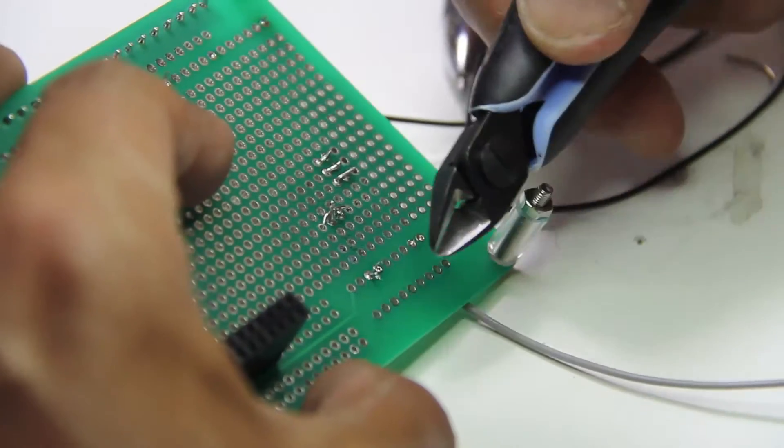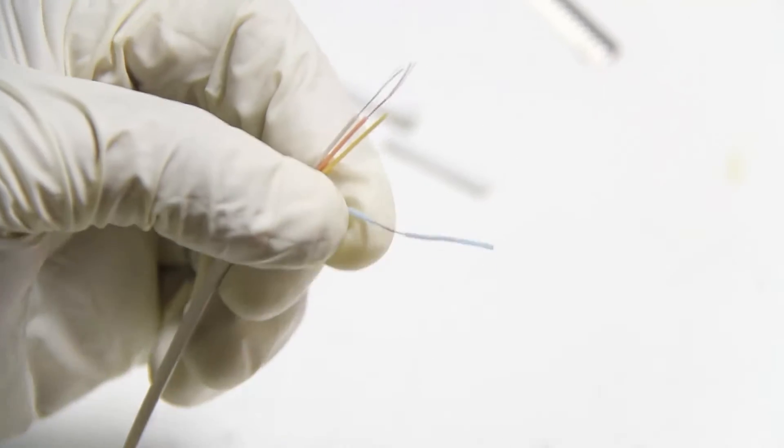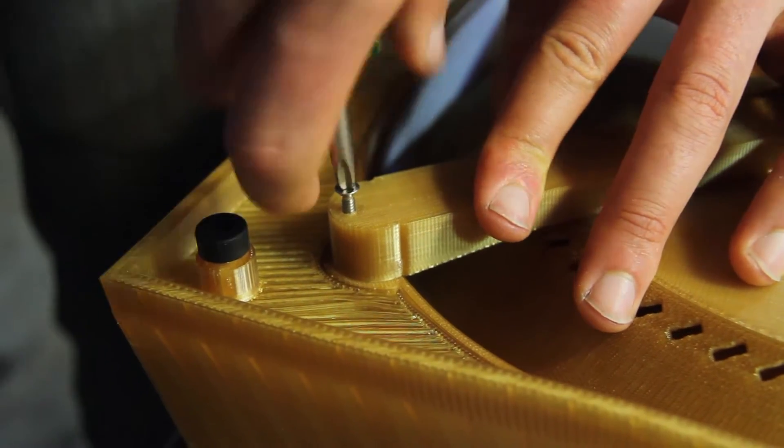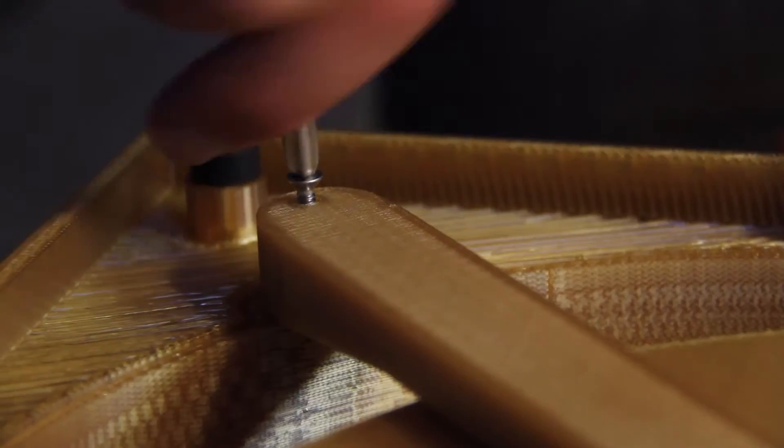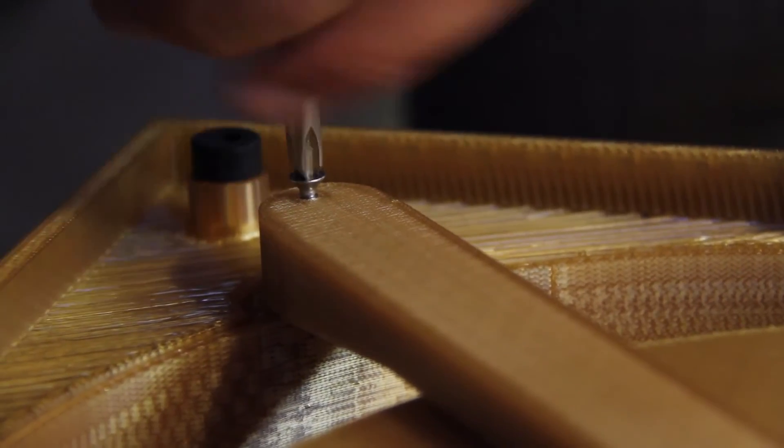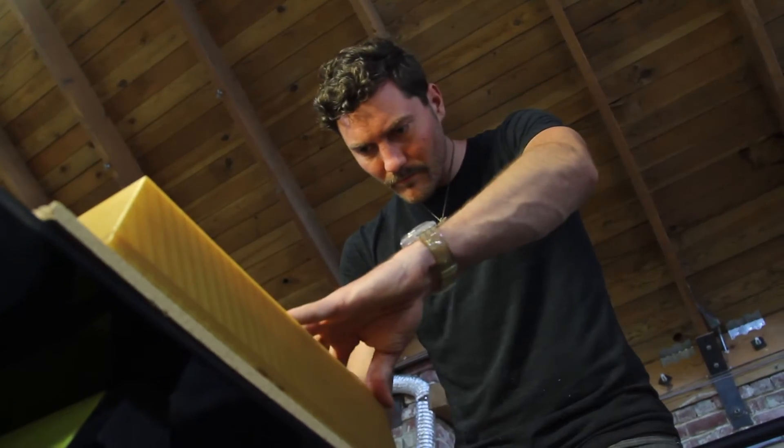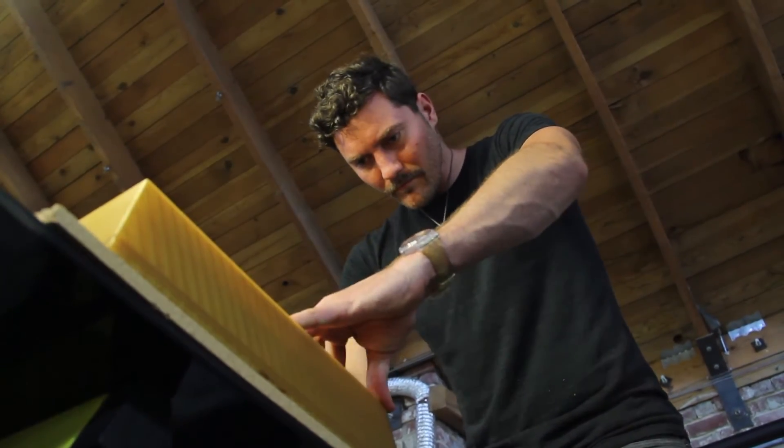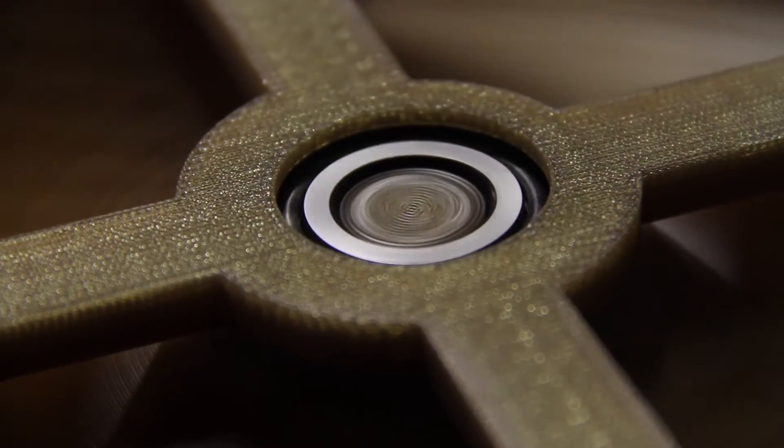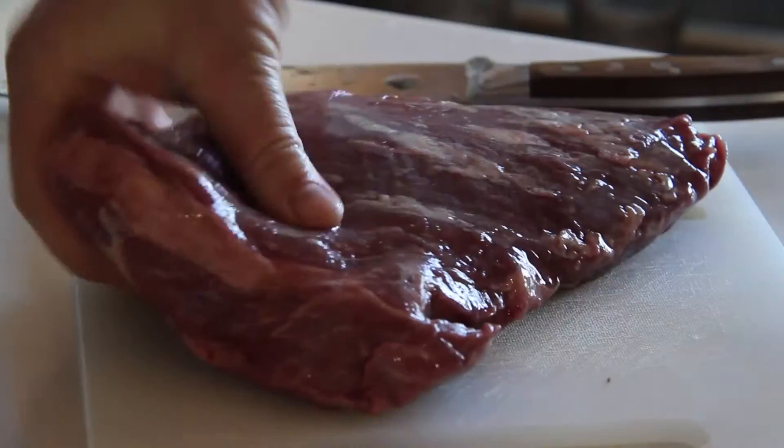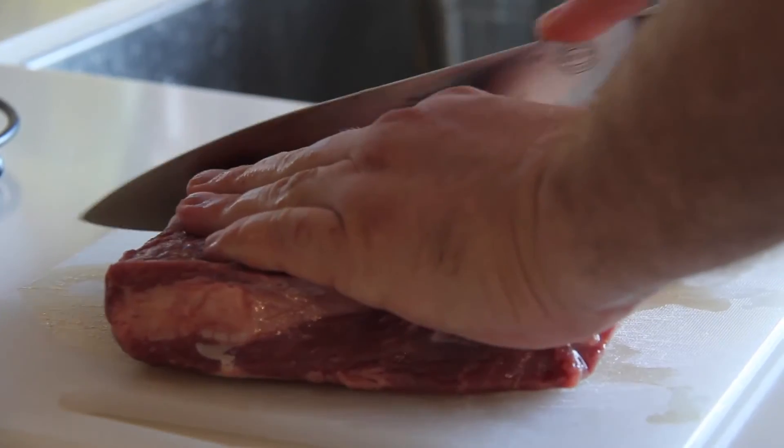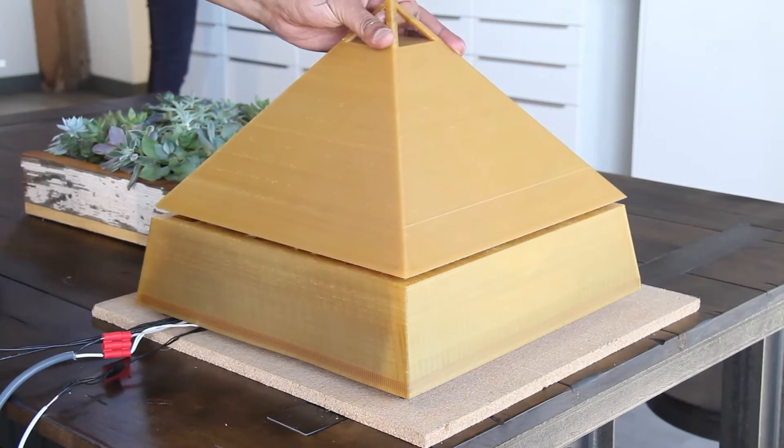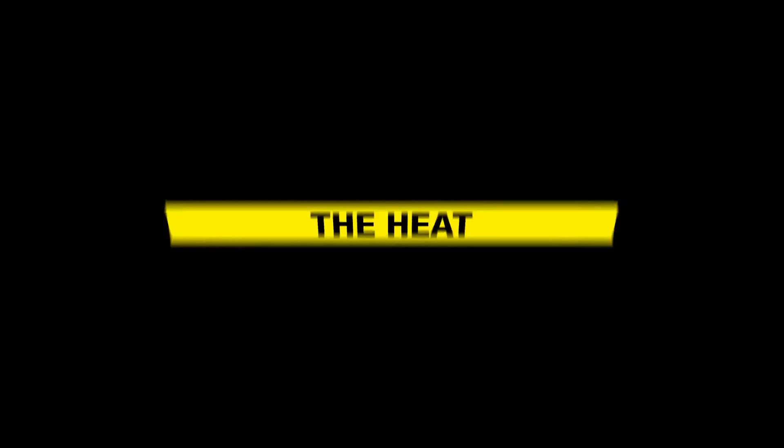This allowed us to create a fully 3D printable lab incubator that can be used for a wide range of applications, such as studying cell growth under unique atmospheric conditions such as Mars. At the temperatures Pyra produces it can even be used to cook food and represents a significant milestone in additive manufacturing. Here are some of the notable innovations achieved with Pyra.